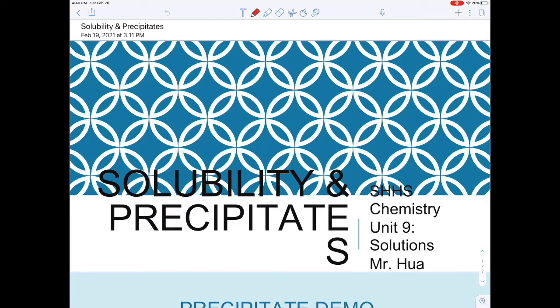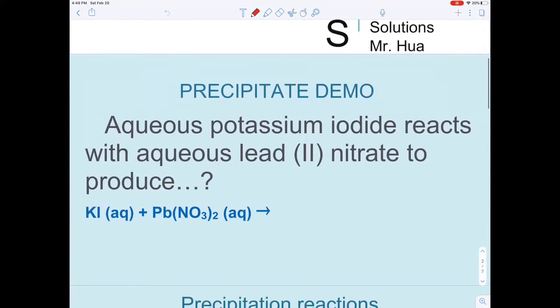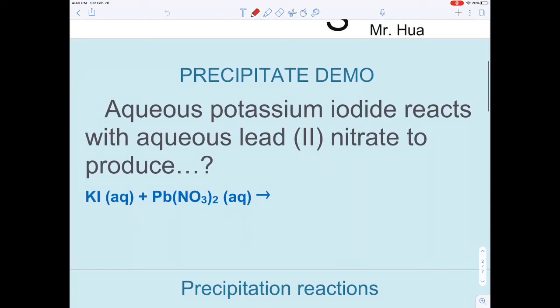Hi everyone, today we are going to learn about solubility and precipitates. We'll start with a demonstration. Aqueous potassium iodide reacts with lead nitrate to produce... let's see what happens. Before we do, 'aq' means aqueous, which just means it dissolves in water. We're going to see these two chemicals react.